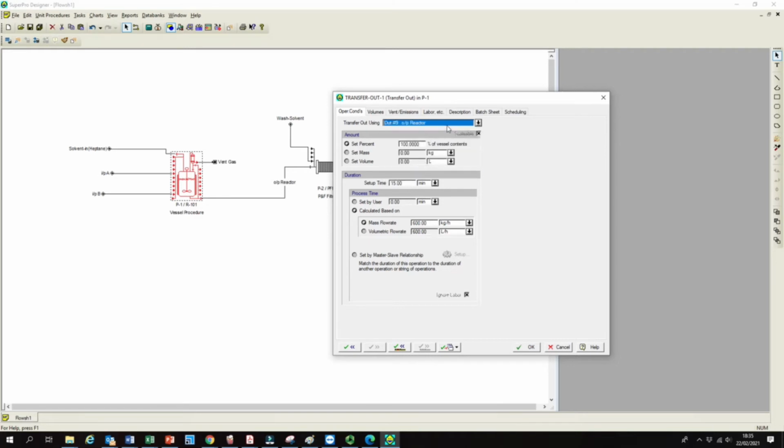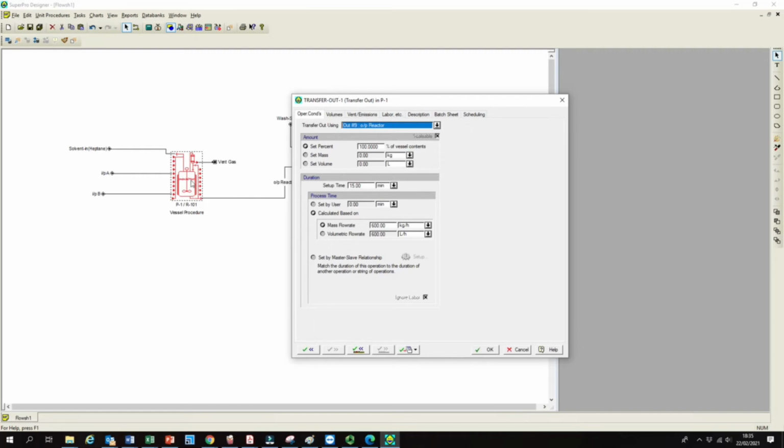this reactor, and then it's asking whether we need to remove all the contents in the reactor. Almost all, but I think removing everything is practically impossible. So let's put 95%. This is a reasonable assumption. And then I think this looks fine to me.